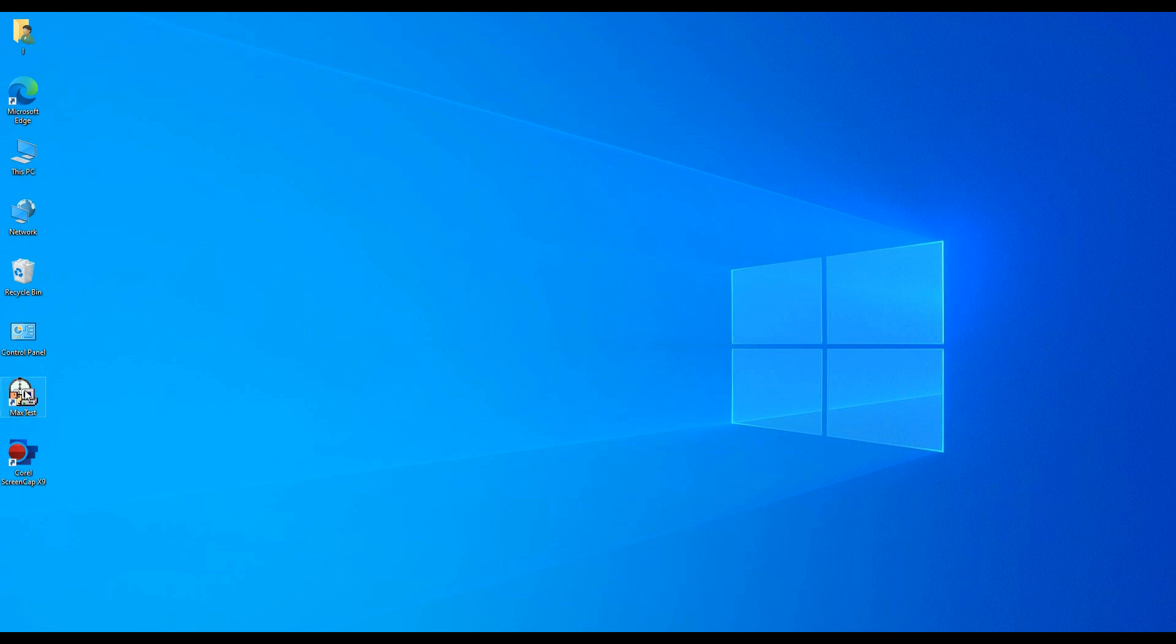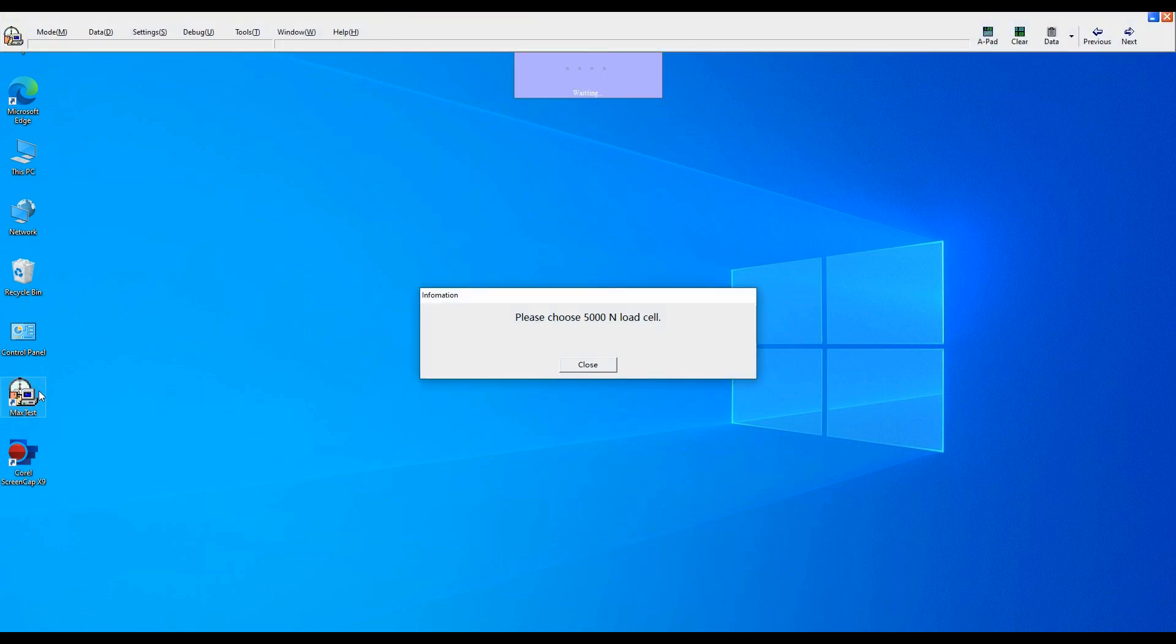First, double-click MaxTest software. It reminds you, please choose a 5000N load cell.